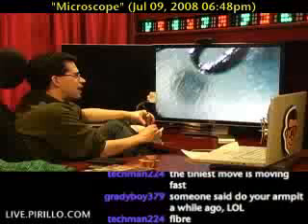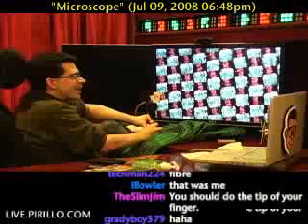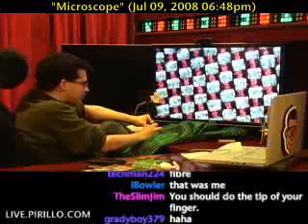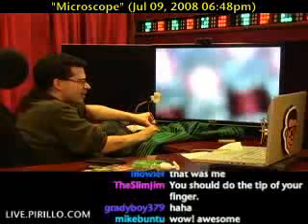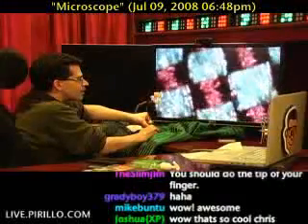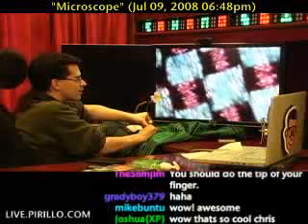Silk — this is what silk looks like. This is Thai silk. Green, well, primarily green, under a microscope. Look at that — just perfect. You compare that to my shirt, my pants, or my socks — look at that. It's just amazing. I think if I go in really close I can get a closer shot of it. It takes a fine hand to fine-tune that. Isn't that just amazing? That's what this Thai silk shirt looks like. It's hard to get it perfectly focused.